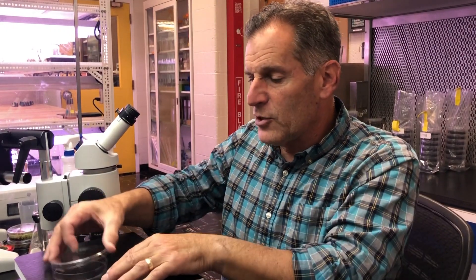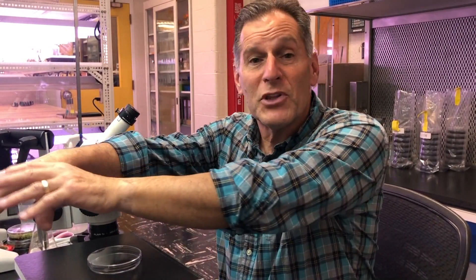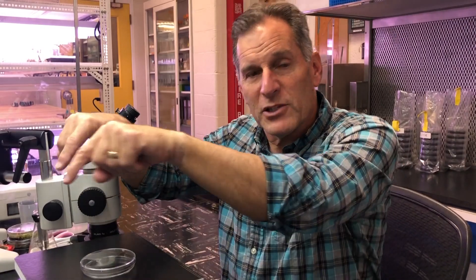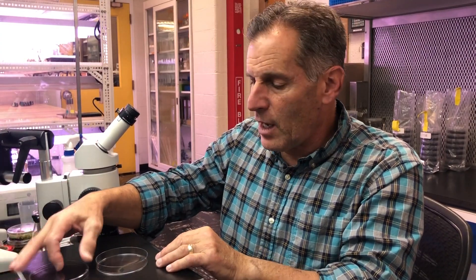Again, you can put the lid downwind, to the left, or to the right — just don't reach around something. Similarly, if your hood is packed, try not to put things behind your sample, because you'll create eddies — little wind currents that will potentially stir up anything and end up inside your dish. Stuff that comes off your fingers ends up in the dish, so you've got to be careful.